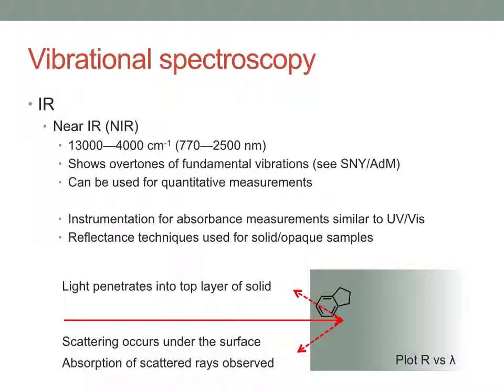But some of that light will have been absorbed, so the backscatter I see has regions of intensity which have been absorbed, which are lower. In other words, I'm looking at information just as if it had travelled all the way through my sample, even though I'm looking at scattered light. It works very, very similar to a traditional absorption machine.